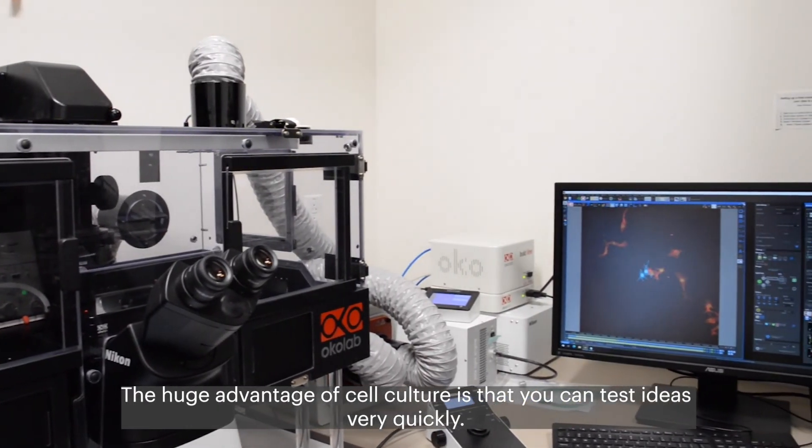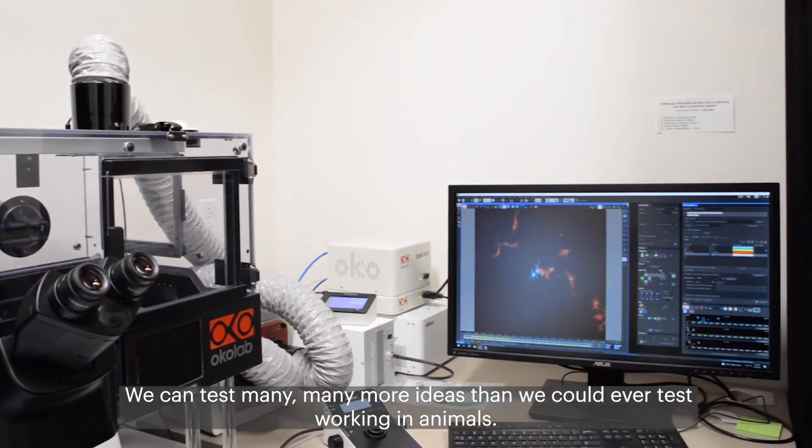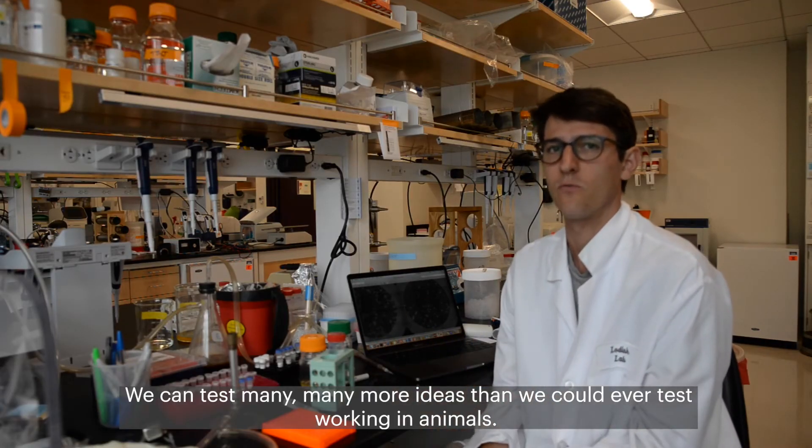The huge advantage of cell culture is that you can test ideas very quickly. We can test many, many more ideas than we could ever test working in animals.